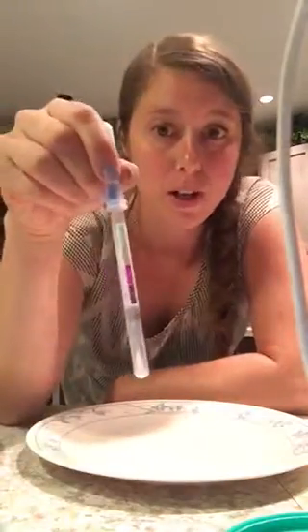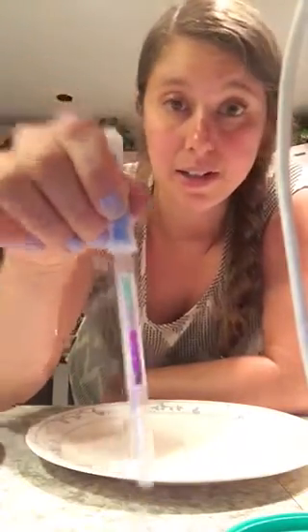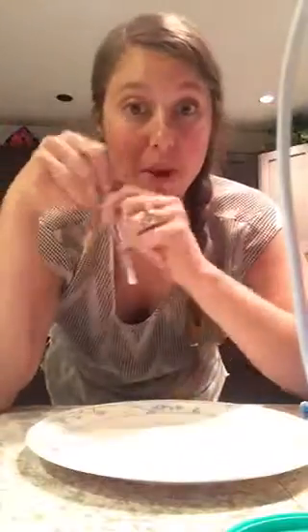So if it turns purple, it means protein is present. If it turns green, it means that your surface is clean. So we test for protein, chicken, because we don't have bacteria. Bacteria takes time to grow, and protein's smaller in size than a virus and is smaller in size than bacteria. So if your cloth is going to clean up something so small, you know it's cleaning up everything else. That's what I explain before I swab. So purple is protein, green is clean, and you want to make sure your swabs are room temperature as well.